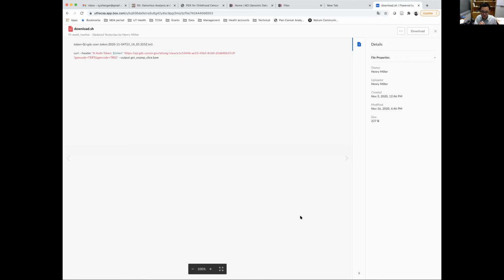So I told you I was trying to download the BAM files to show you how the fusion reads look in IGV, but it wasn't very successful. Even for the cases where I know the fusions exist, after downloading the BAM files that cover both gene regions of the fusion, I don't see any fusion reads in that small BAM.